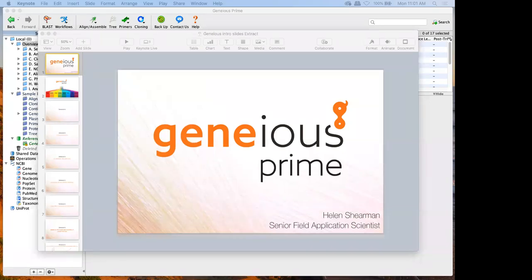So I'm so glad that there's so much interest in this software. Over 40 people registered for the workshop, and that's great. As people know, we've started a license last month, and the license will go for a year. We'll be looking at the usage and also feedback over that time, and hopefully there'll be interest and funds to have the license renewed in the future.